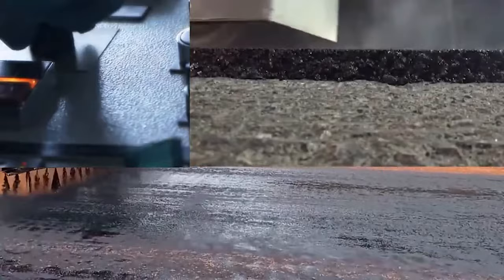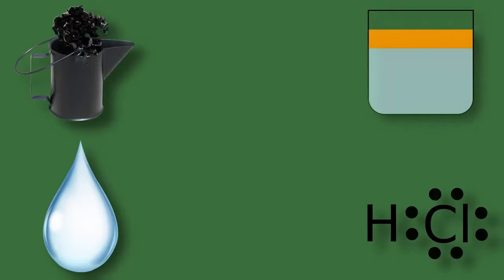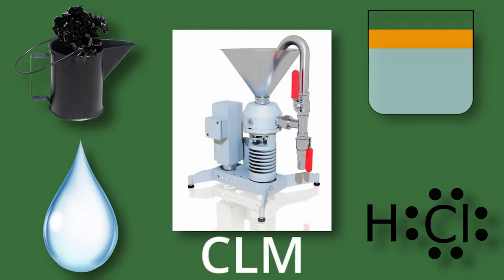Hello! In today's video, we will tell you how to prepare a bitumen emulsion of CMS2 grade in laboratory setting. For this purpose, we will need bitumen, water, an emulsifier, hydrochloric or orthophosphate acid, and a laboratory colloid mill of CLM type.